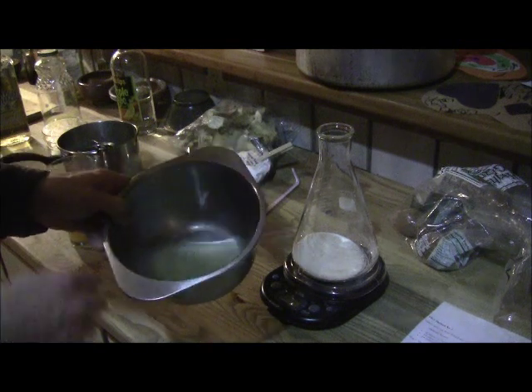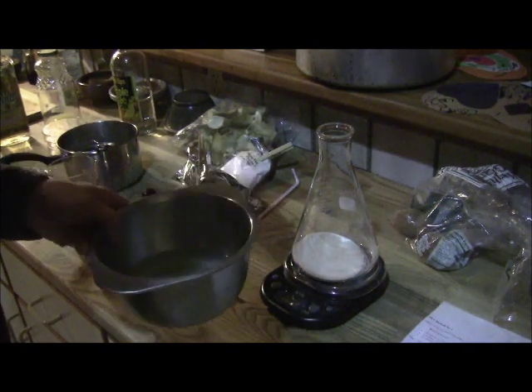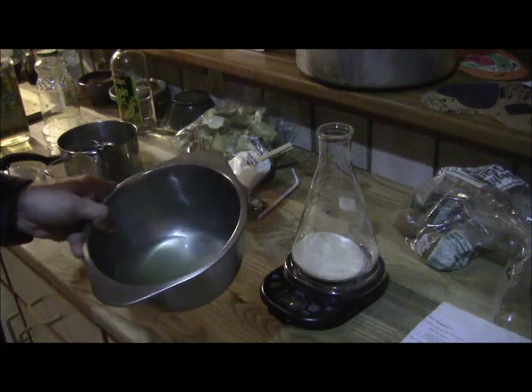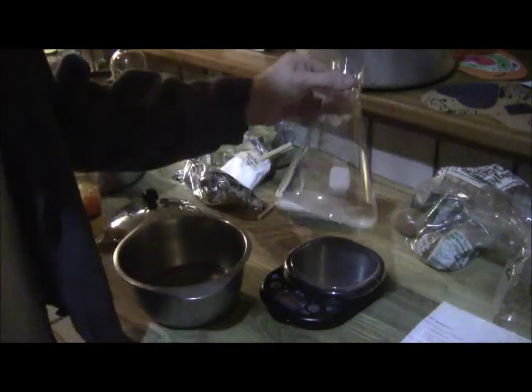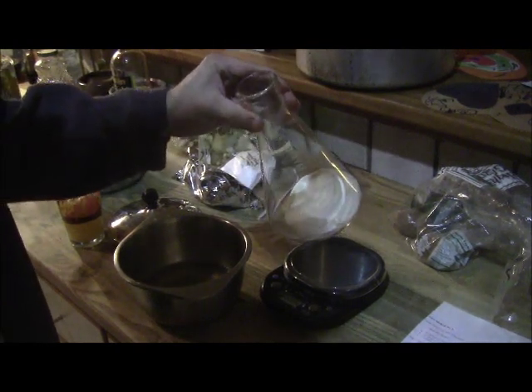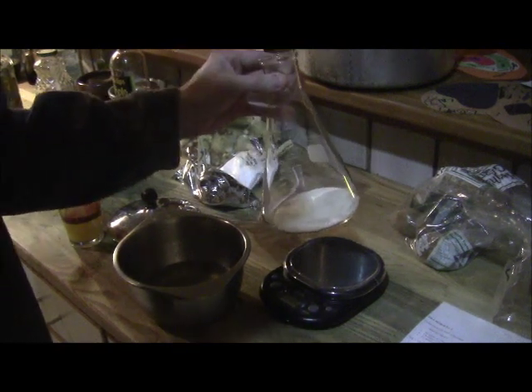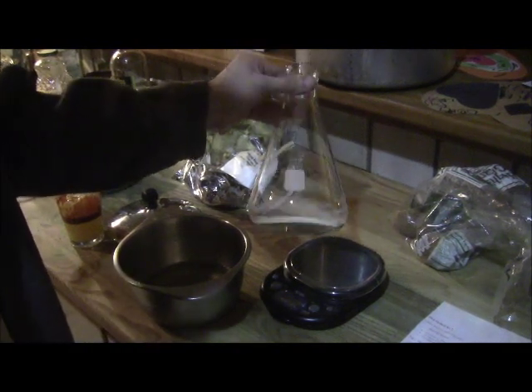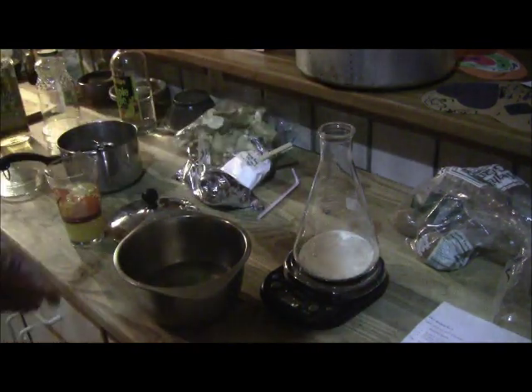After boiling, you strain the potatoes out. I have that strained here in a stainless steel kitchen bowl. It's a little cloudy — some starch solids from the potato breaking down are in there, and that's fine. This is for mycelium to grow on, so we're not going for perfection. I'd already measured out about 18 grams of agar and 8 grams of dextrose into this Erlenmeyer flask.